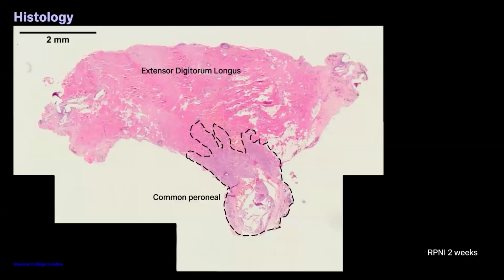So we went to histology. This gave us a little bit more of a view of what we could potentially achieve. Here we're looking at a standard H&E stain, and you can start to appreciate levels of nucleation or nuclear proliferation in the region where the nerve is embedded. This image was taken using the Leica Microsystems system.